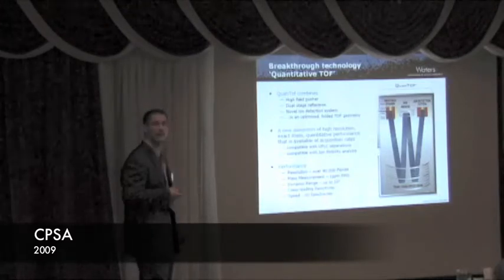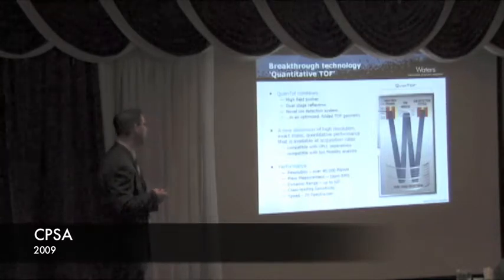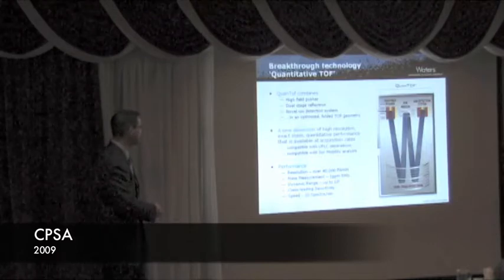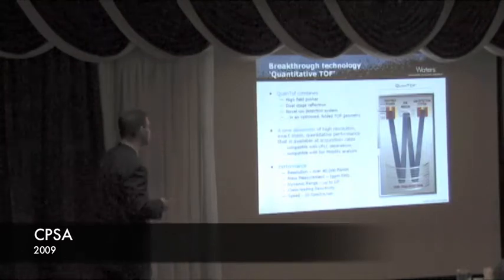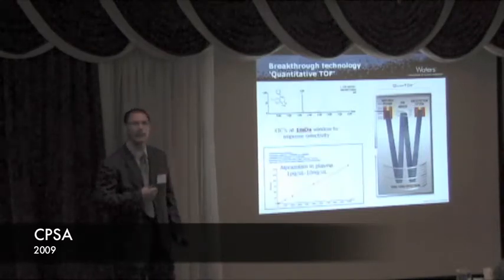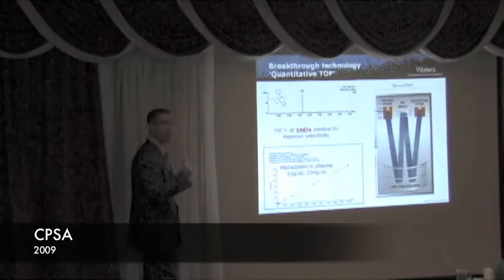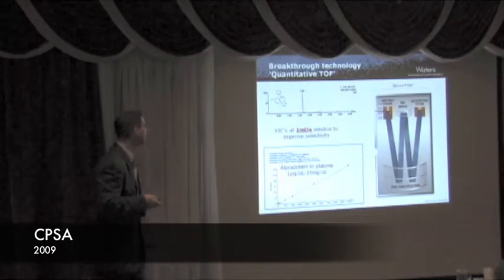That is typically 40,000 resolving power, 1 ppm mass measurement accuracy, with 5 orders of linear quantitative and mass measurement dynamic range, with a sampling rate of 20 hertz. So the resolution is independent of our scan rate. It's constant across that. So what do we expect? What do we gain here? Well, we should get 5 orders of quantitative dynamic range. Here I show you 4. We're using narrow mass extraction windows to get the specificity, and we can get good quantitative dynamic range, okay?